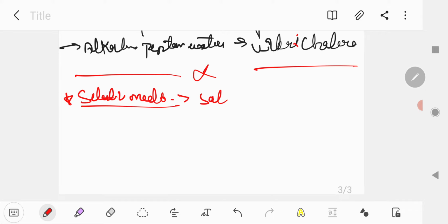It is the solid media plus inhibitory substance.